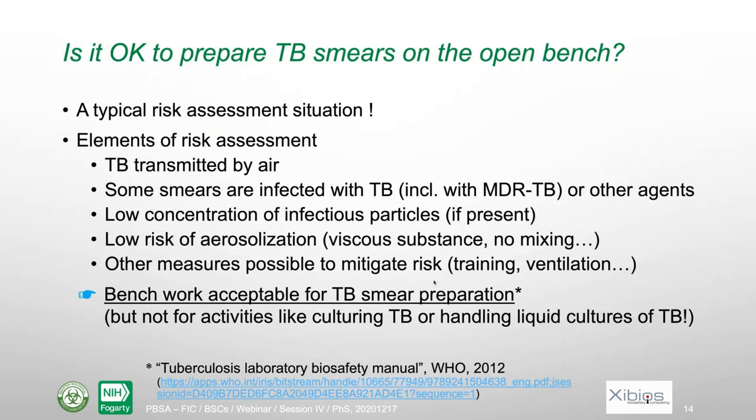A next question was very specific. Is it okay to prepare TB smears on the open bench? This is a typical risk assessment situation. And of course, it's quite important for Pakistan because many people work on TB, and also many people work on the bench in Pakistan, but also in some other countries. So this question is very important. I like it also because it's a typical case of risk assessment.